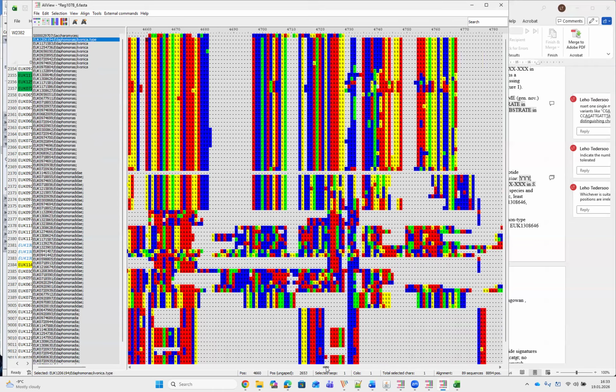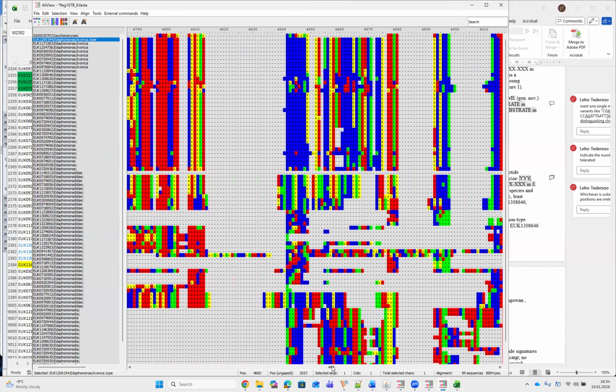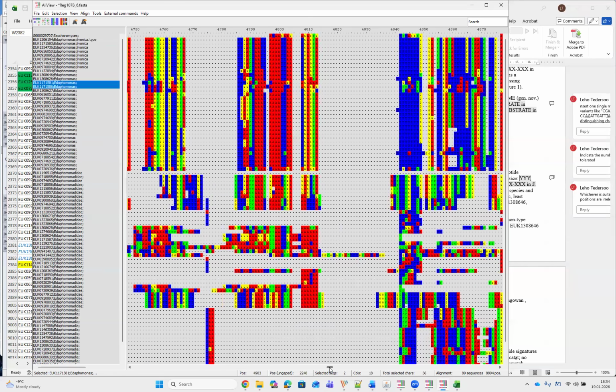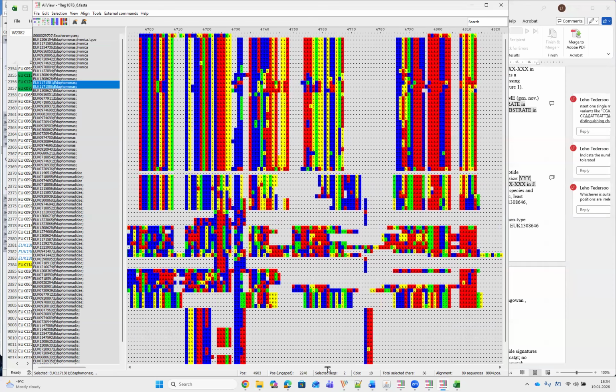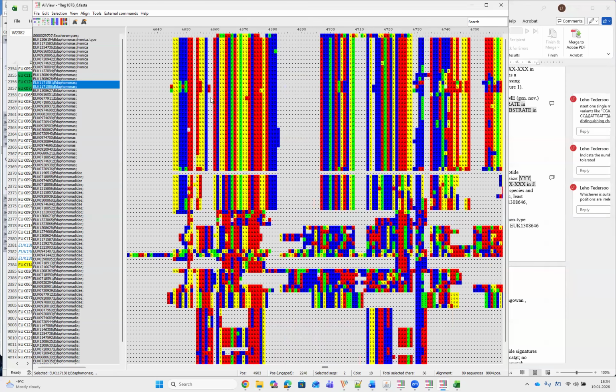But let's take a quick look further. Again, this problematic group in this genus is not well aligning to the rest, and now here we have reached already the large subunit, so we have to keep what we found.